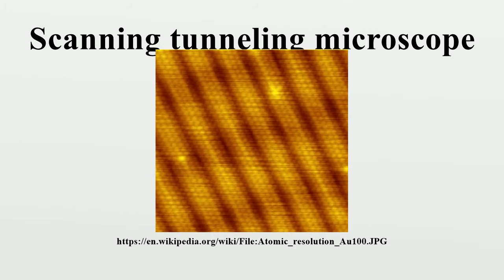Other STM-related studies. Many other microscopy techniques have been developed based upon STM. These include photon scanning microscopy, which uses an optical tip to tunnel photons; scanning tunneling potentiometry, which measures electric potential across a surface; spin-polarized scanning tunneling microscopy, which uses a ferromagnetic tip to tunnel spin-polarized electrons into a magnetic sample; and atomic force microscopy, in which the force caused by interaction between the tip and sample is measured.